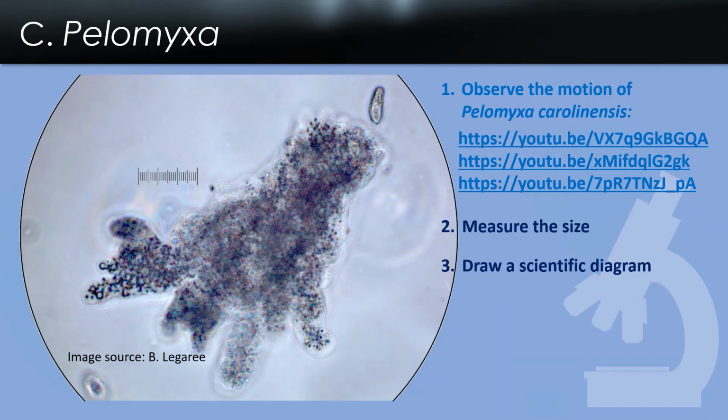Here's the picture of an amoeba that I mentioned. I would show you just how big these things are. If you take a look in the top right corner, there is a paramecium. So you get an idea how big an amoeba is compared to a paramecium. In fact, amoebas will eat the paramecium for food. And I believe that is actually why they're in the same jar with the amoeba, so that the amoeba can actually have some nutrients.